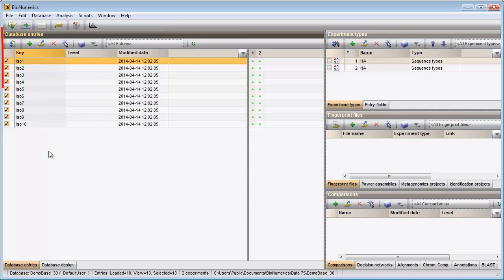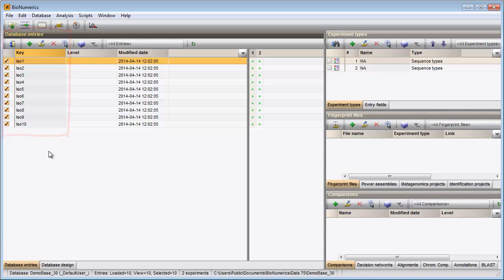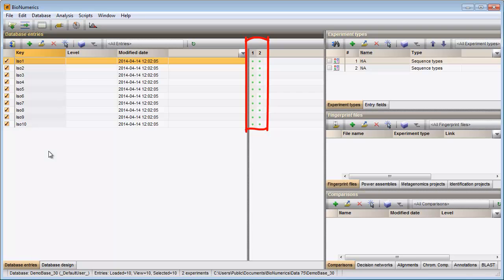The entries are displayed in the database entries panel and are automatically selected. For each experiment defined in the database, there is a column present in the experiment presence panel. A colored dot is displayed if a sequence is present for an entry-experiment combination.